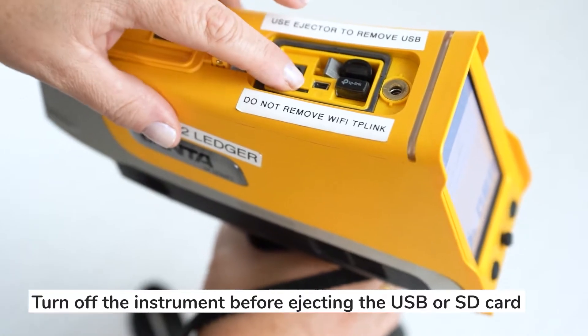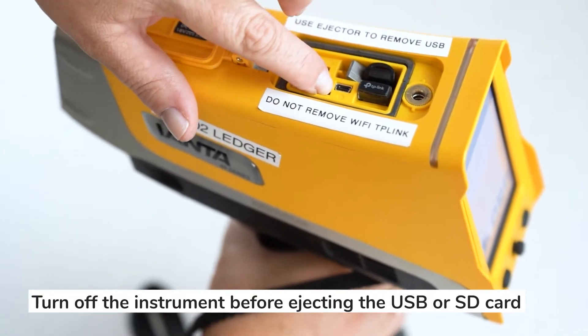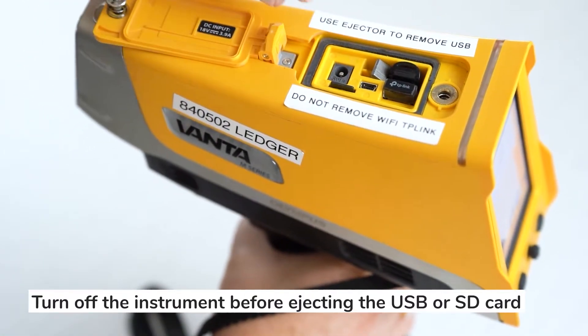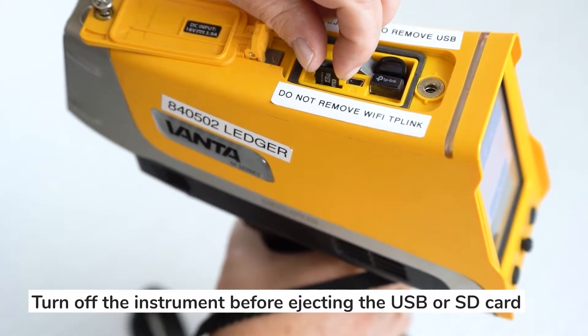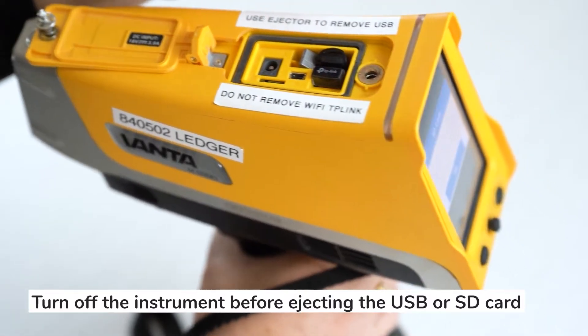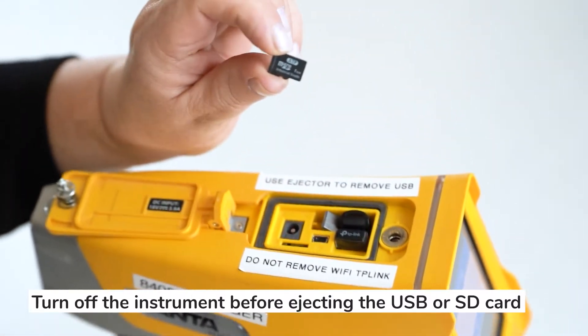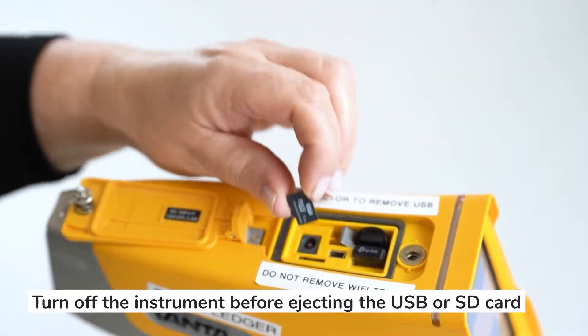And this one here, you press on it and just remove it like so. Put it in an adapter and you can put it in your PC.